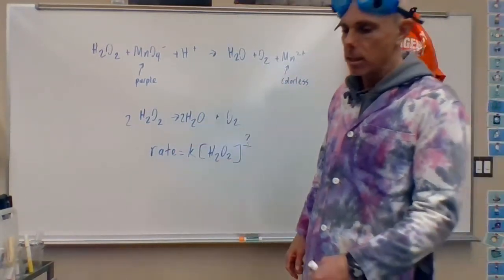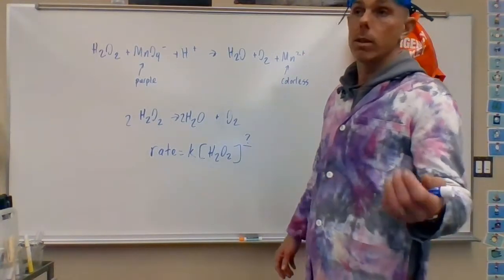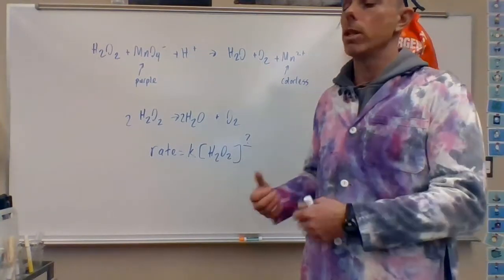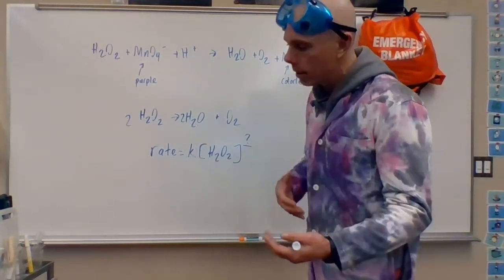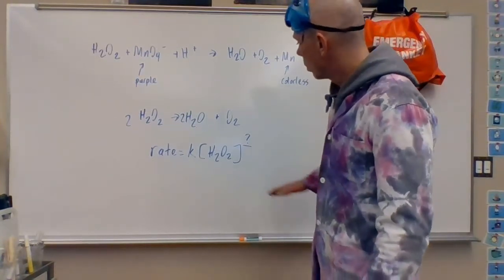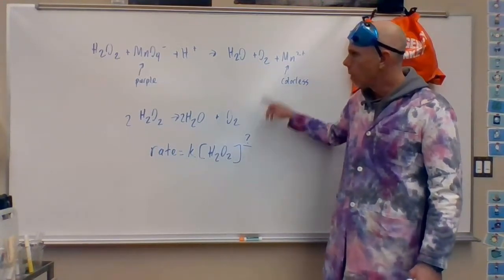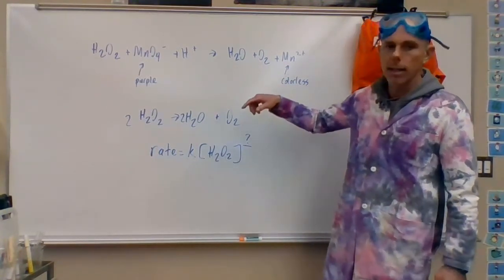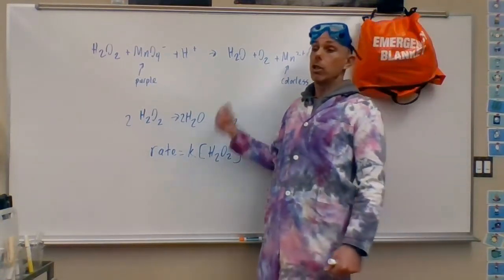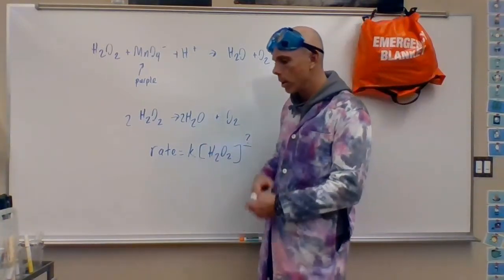We'll manipulate the concentrations into natural logs, see if that's linear, and if it were, we would know it's first order. But if it isn't, then we graph inverse of concentration of peroxide against time, and if it's linear, then we know it's second order. So again, the goal is to determine the rate law for the decomposition of hydrogen peroxide, what the order is, and the way we do this is titrating peroxide with permanganate ion, looking for the color change, which allows us through some calculations to figure out what the concentration is at various time points, which can be graphed.